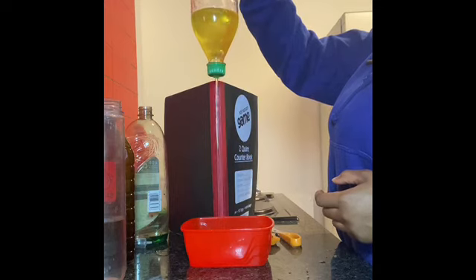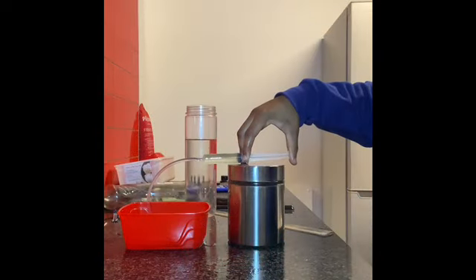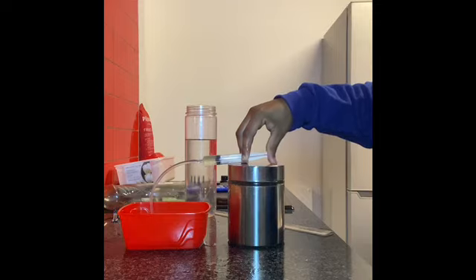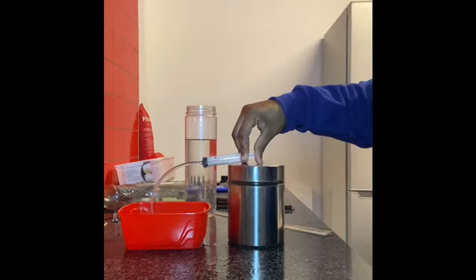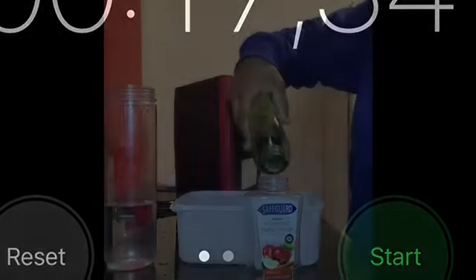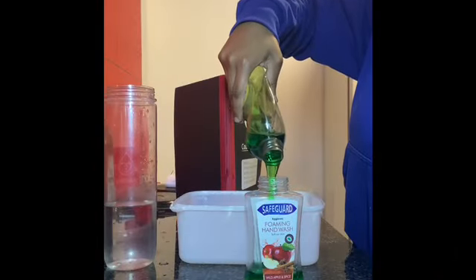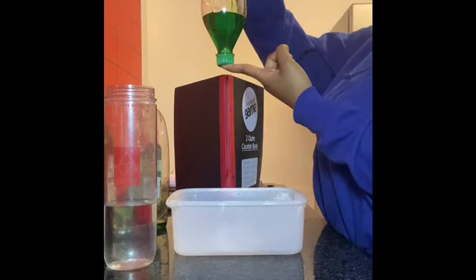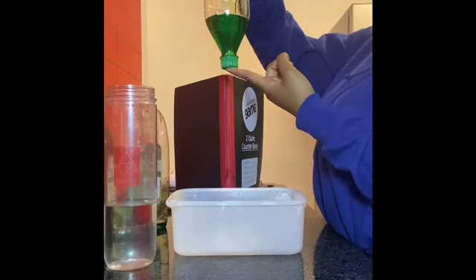The table of results in the appendix indicates that the dishwashing liquid had the highest density, followed by the hair conditioner, and the lowest density was observed in the sunflower oil. The experiment was efficient in presenting the differences in density amongst the tested fluids. However, the experimental values that were calculated were inaccurate.